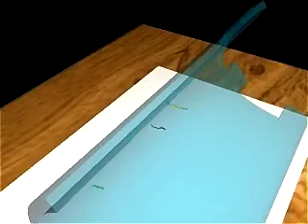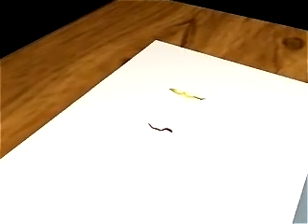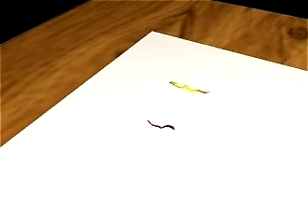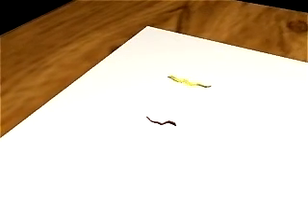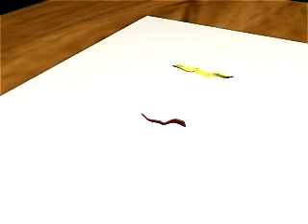The proteins stick to the membrane in the same positions they had in the gel. Thus, the membrane is a blot of the gel. The gel is discarded, and an inert protein such as serum albumin is then used to coat the membrane so no other proteins will stick.